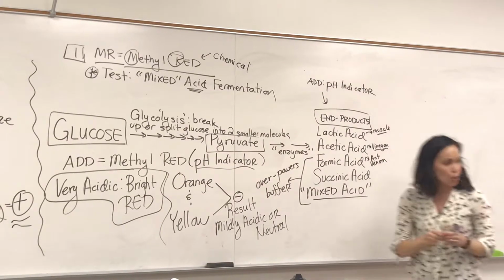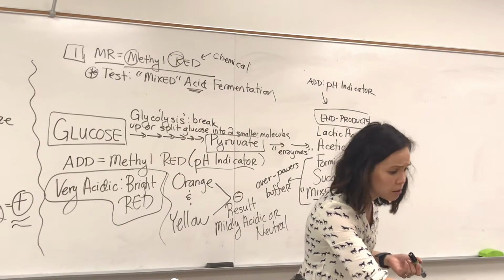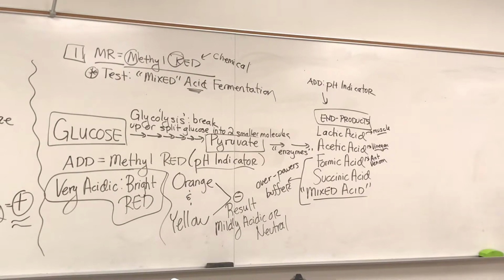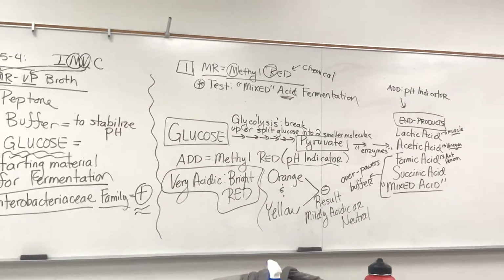Do you guys have any questions about the mixed acid part? So when you break down glucose, you would end up with all the possible acids. We're only looking for one in particular, maybe? Yeah, it'll be all of them. All of them. Okay.